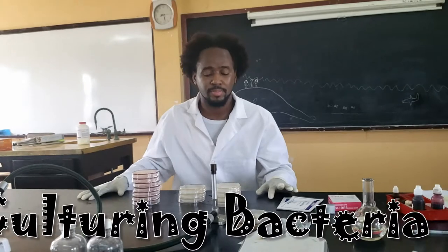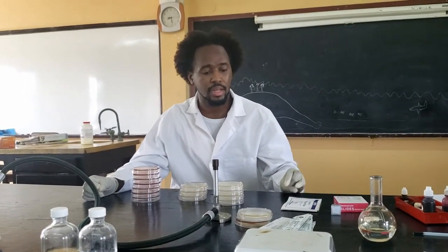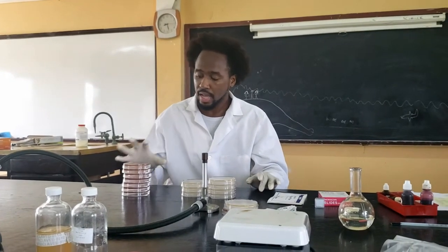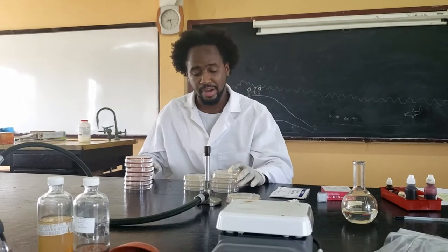Welcome to your Evolution Biology Lab. So today we'll be culturing bacteria. By now you should be pretty much familiar with what bacteria is. We know bacteria can be found anywhere. And the medium which we normally use to culture bacteria is what we call agar.